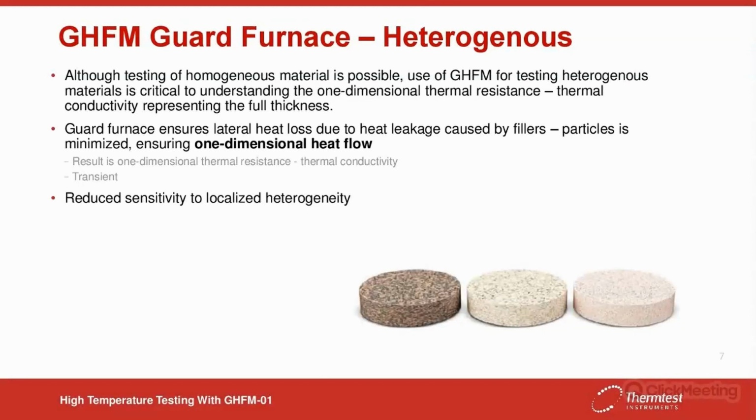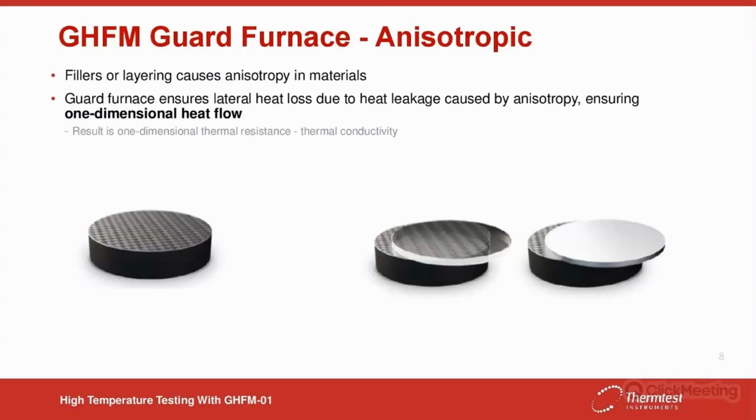So if there's any distribution or poor distribution of particles or fillers or any other degree of heterogeneity, you're capturing that in the full thickness thermal resistance and calculated thermal conductivity. Transient methods should be looked at very specifically and critically when testing heterogeneous materials to see if they fit the use and ideal theory of that method.